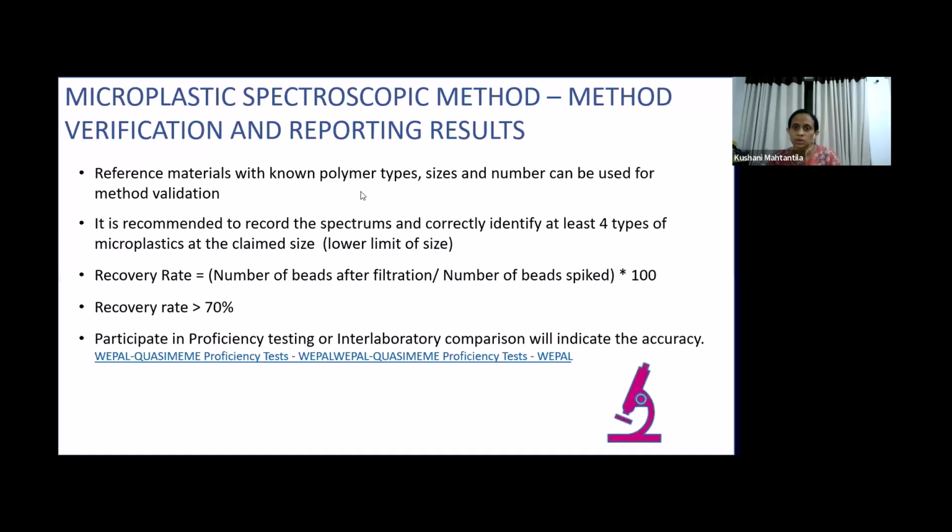So, method validation and verification. What is method validation? I want to talk a bit about method validation. When we use a method, we want to confirm that the method can be used to analyze our samples. We have to confirm whether this method is suitable for our analysis. That is done by the method validation.